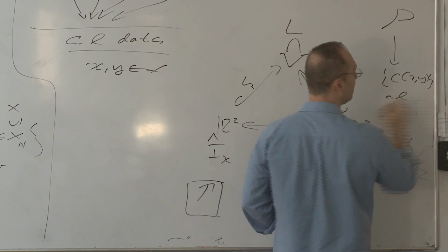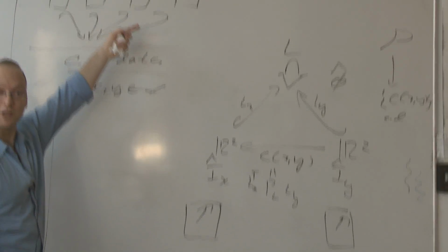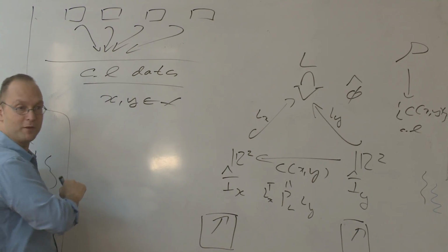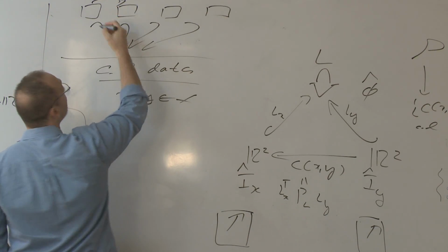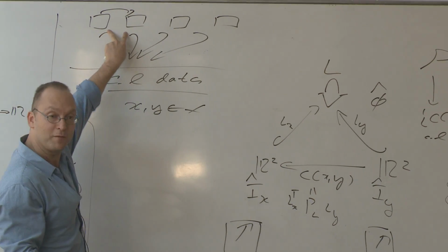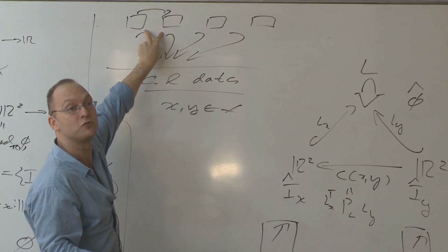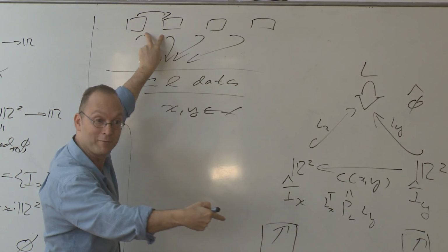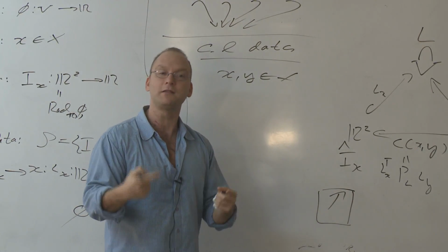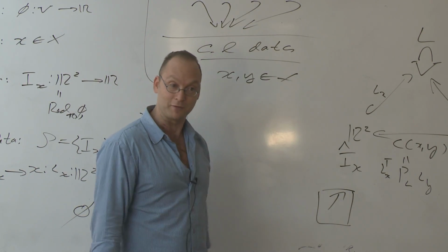And this is called the common line data. So again, let me summarize the situation. We have the images, and we see that from the images, we're able to compute for every ordered pair of images a 2x2 matrix. This is called the common line matrix. So for every ordered pair of images, we can compute from the images the 2x2 rank 1 matrix, which is the common line matrix between the corresponding frames. So although we don't know the frames, we are able to compute from the images certain non-trivial binary relation between the frames, which is given by these common line matrices.